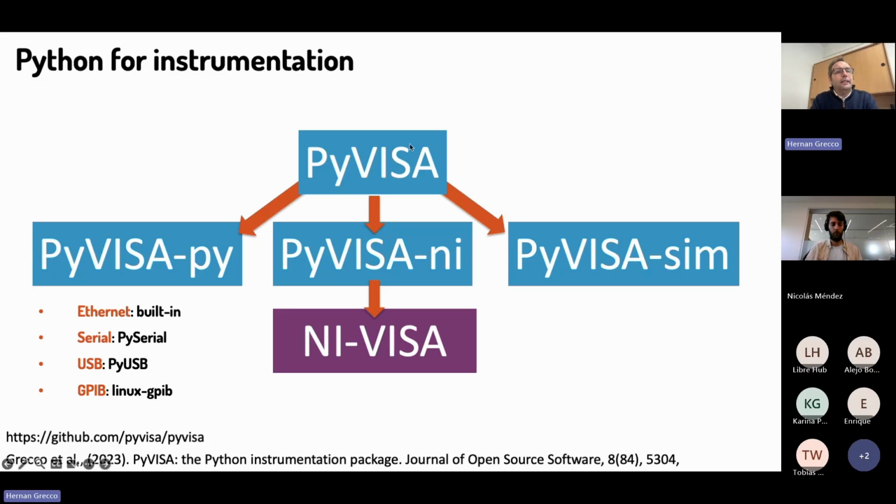This is the front end, and it contains a main backend, which is this PyVisa NI, which talks to the C library, and then it contains another backend, which is a pure Python version of this backend. This is very useful for hardware in which this hardware library is not available. And I also created a simulation library.